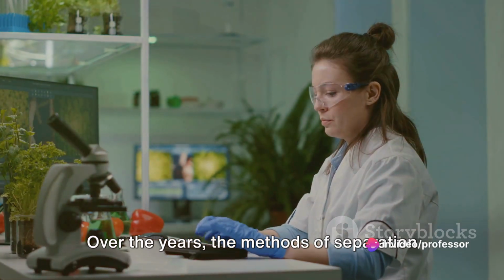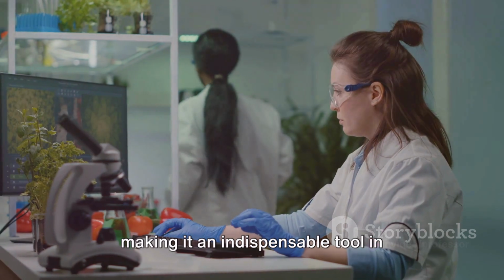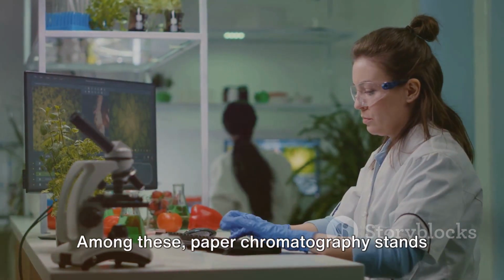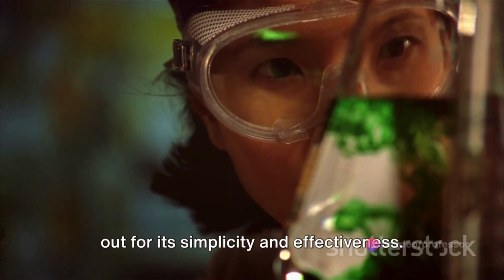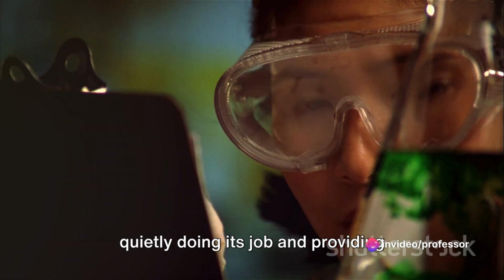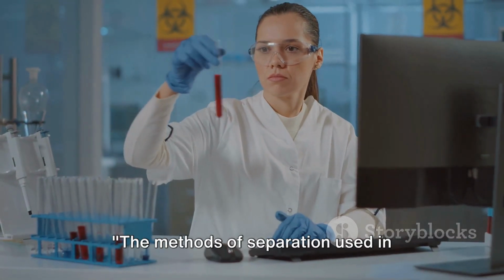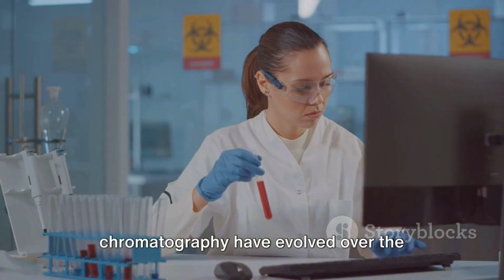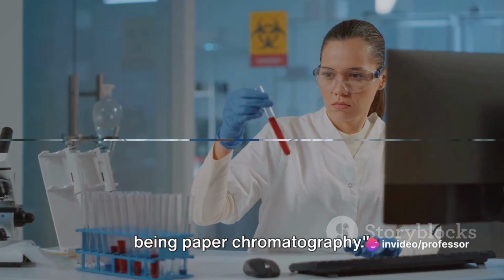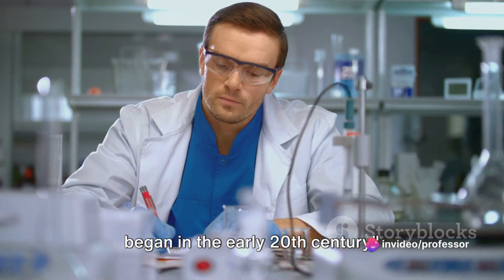Over the years, the methods of separation used in chromatography have evolved, making it an indispensable tool in scientific research. Among these, paper chromatography stands out for its simplicity and effectiveness. It's like the unsung hero of the lab, quietly doing its job and providing invaluable data to researchers. The journey of paper chromatography began in the early 20th century.